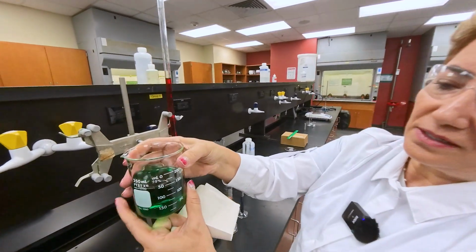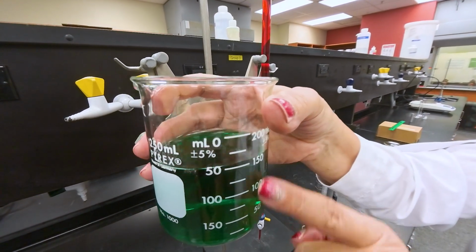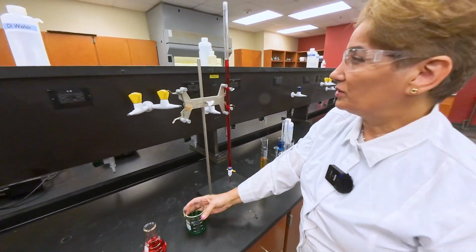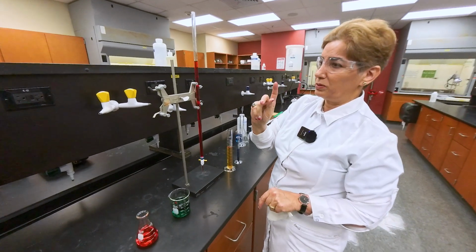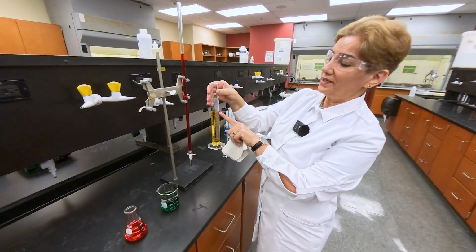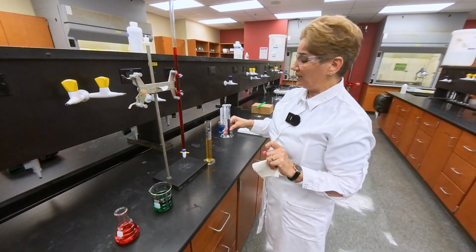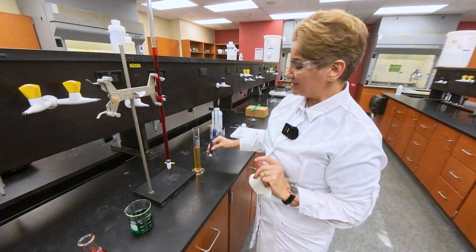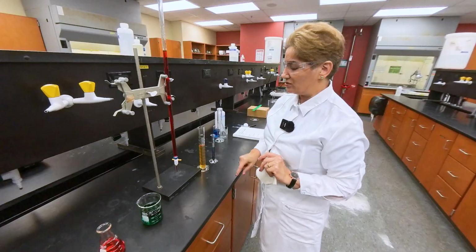So you cannot record any number with decimal places when you are using a beaker. Notice that for a burette, your number must have 2 decimal places. With a graduated cylinder, the number you are recording must have 1 decimal place, and for a 10 milliliter graduated cylinder, your number must contain 2 decimal places, because it's more accurate than the 100 milliliter graduated cylinder.